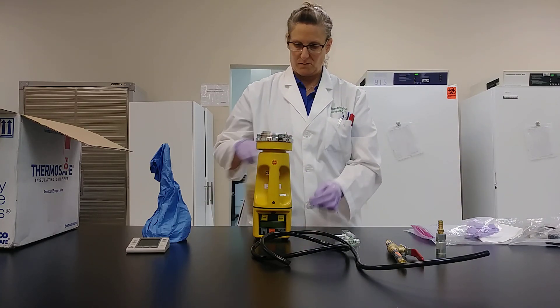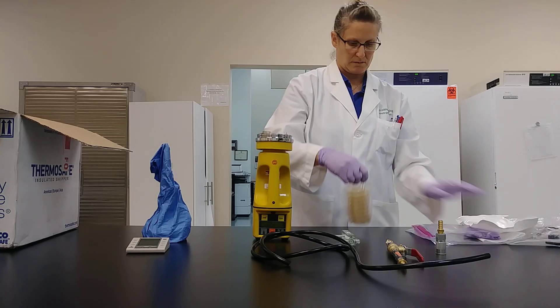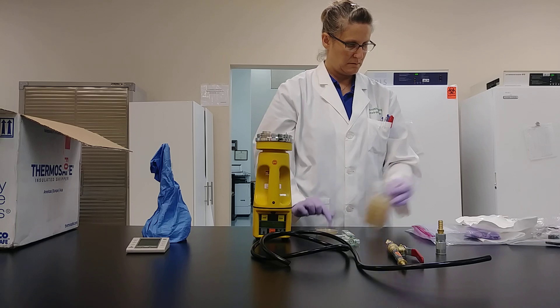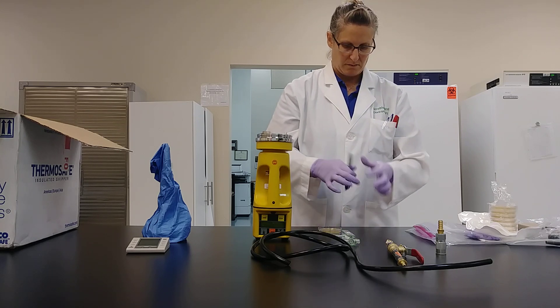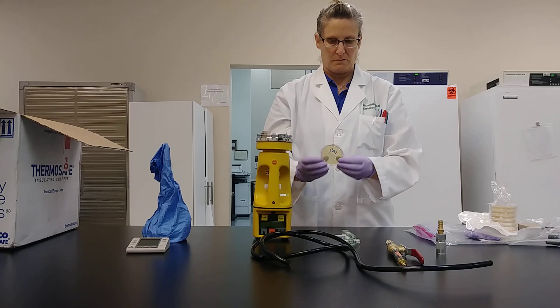The first step is to label your samples. Remove your samples from packaging aseptically and label with the sample ID on the base of the auger plate, so if the lid comes detached, your label is still intact.